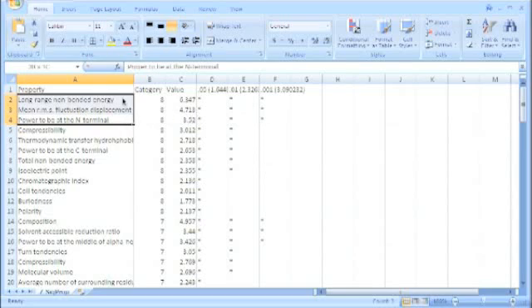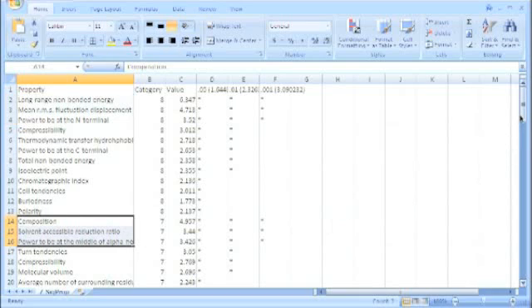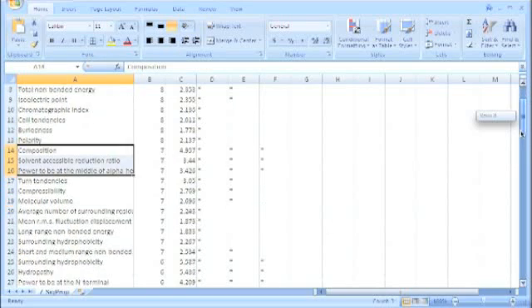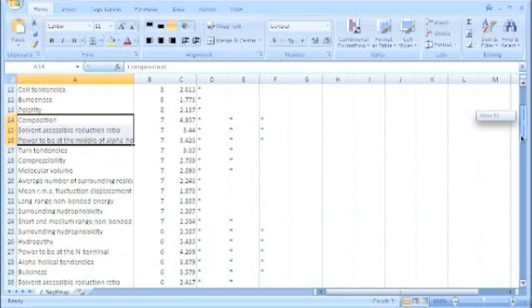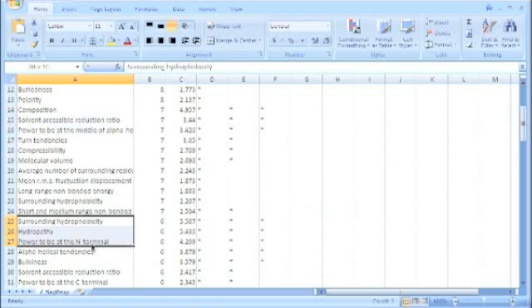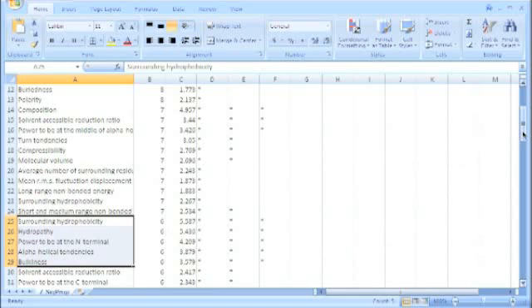The power to be the end terminal. And for the category seven, there are those right there that are significant. And then usually go down to about category six. If you're really desperate, you go down to five. But around five there, the changes aren't so significant. So if you write down, these are going to be the most changed. And you can look into these more specifically like we will do in just a second here.